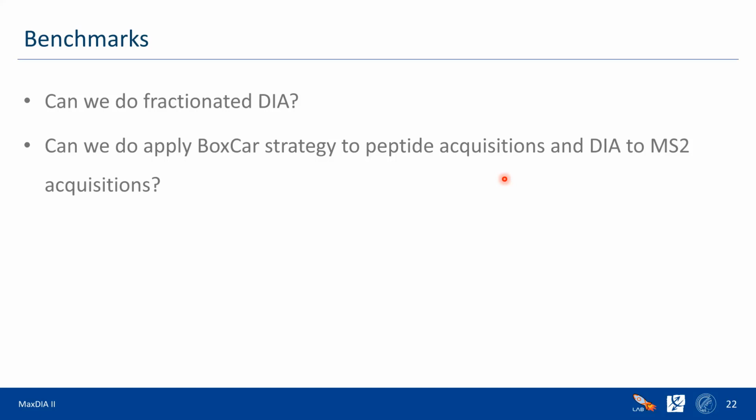But I have to be honest, fractionation DIA, when you are making a DIA measurement not just on a single shot, but on several fractionated samples, is not very common. The question is, can we use the MaxLFQ algorithm, which was extended for DIA samples, with the same success for fractionation data?